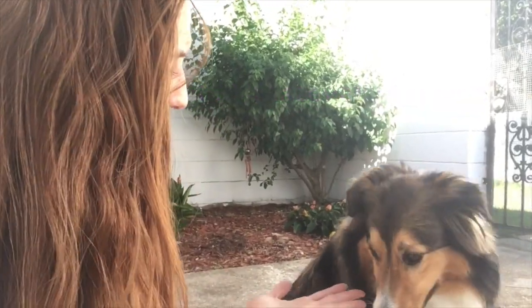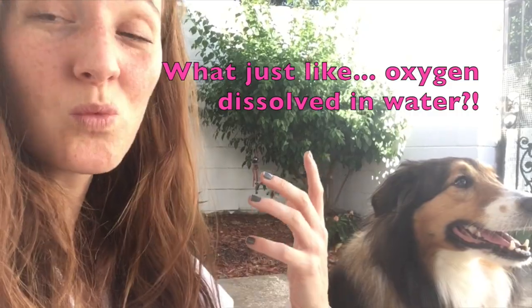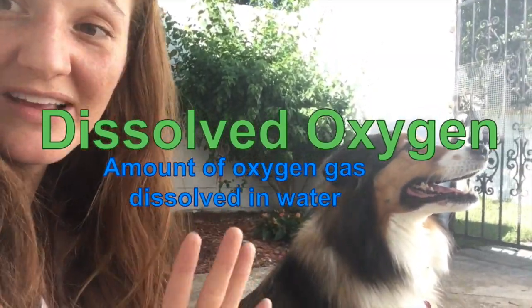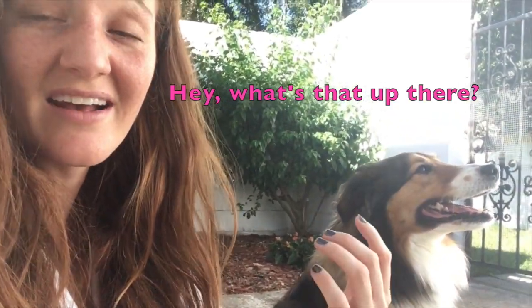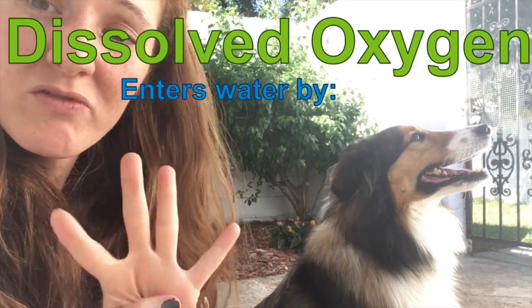Now, what is dissolved oxygen? That's right, Colette. It's the oxygen dissolved into the water. And it's really important because just like us, Colette's breathing, I'm breathing, animals in the water need to breathe oxygen as well. Now, it can be absorbed into the water 4 ways.